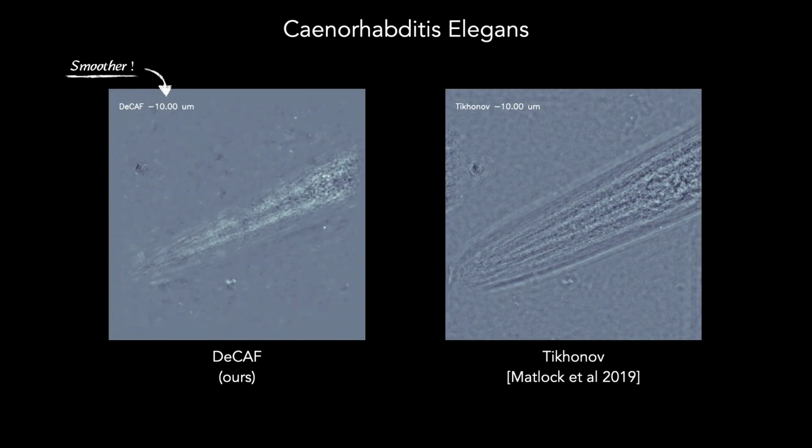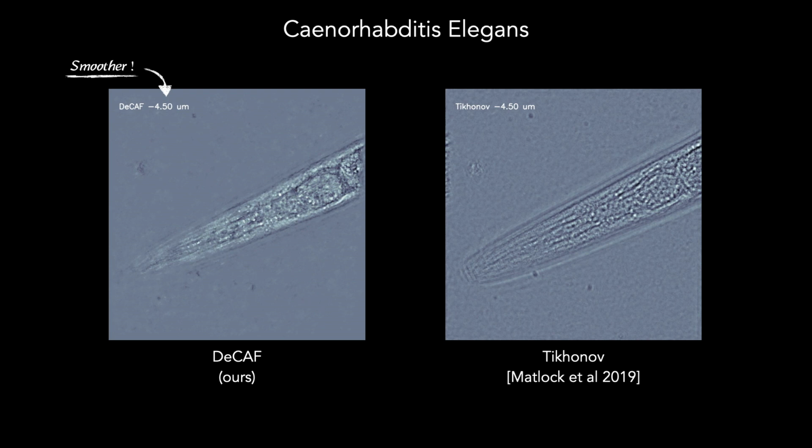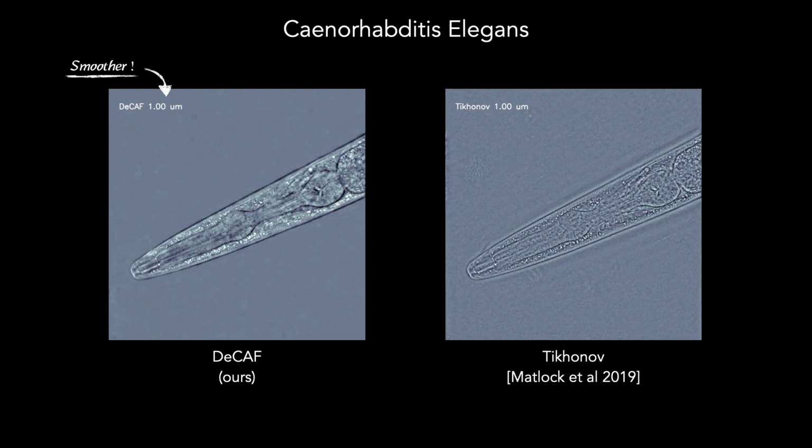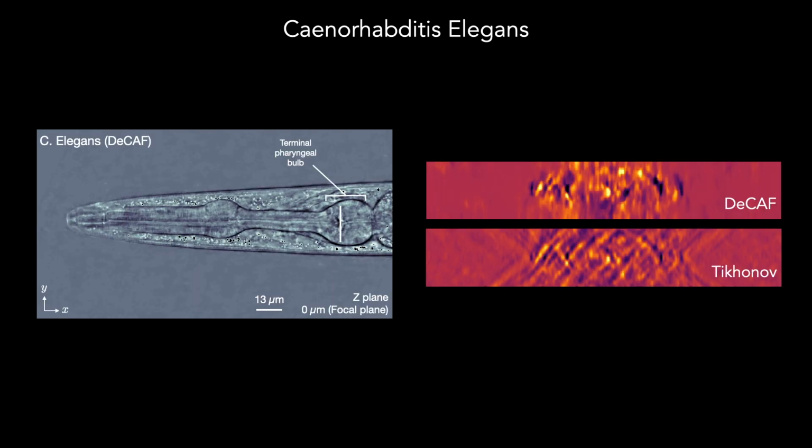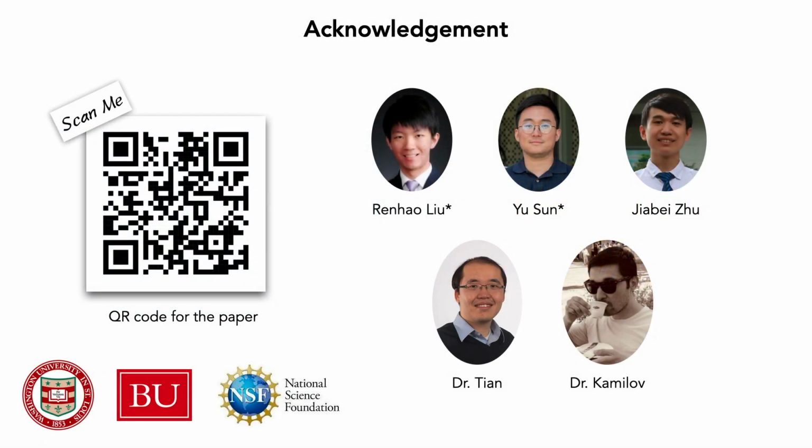Finally, we show a result from a C. elegans sample. Our result is smoother and much clearer than the Tikhonov reconstruction. Here, we show the improvement on the lateral view. Thank you for your attention.